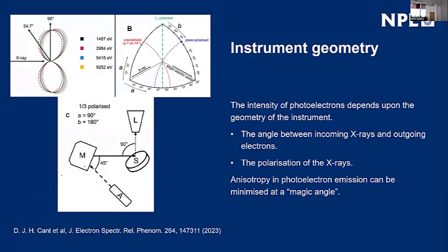The other thing you need to know is instrument geometry. I'm not going to dwell on this because if I try and explain this diagram, it'll take too long. But the key thing to note is there is a difference between XPS and HAXPES.